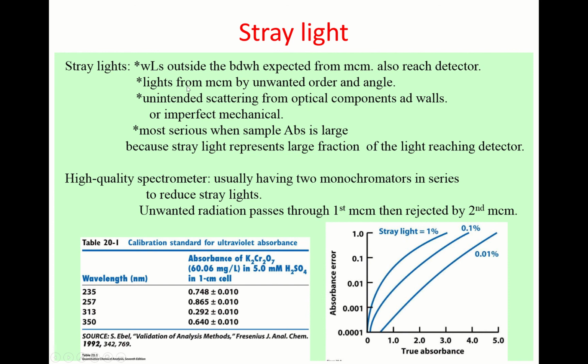It comes from light from unwanted orders and angles, unintended scattering from optical components, or an imperfect mechanical system.